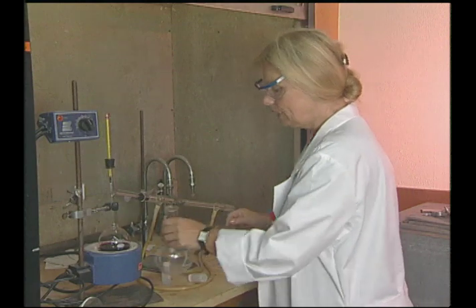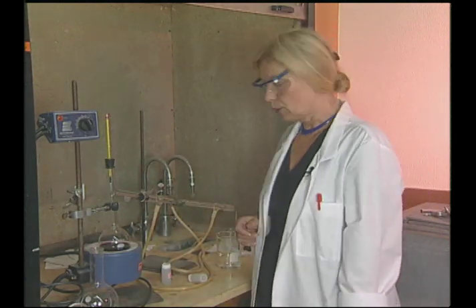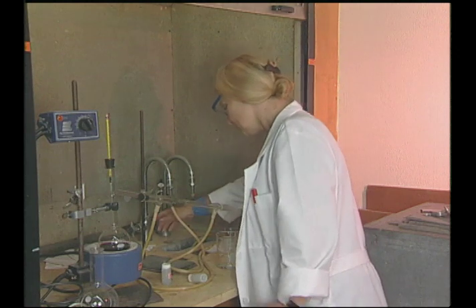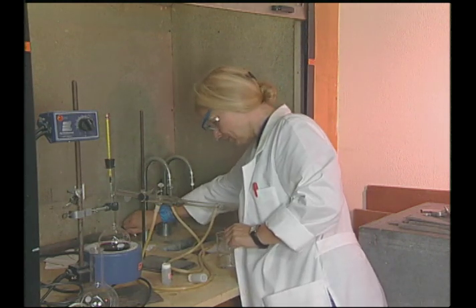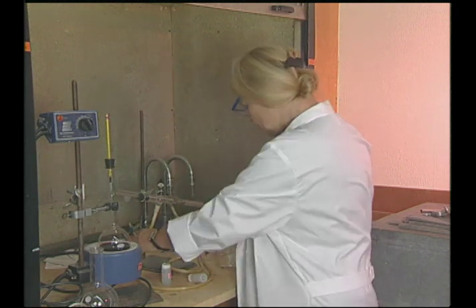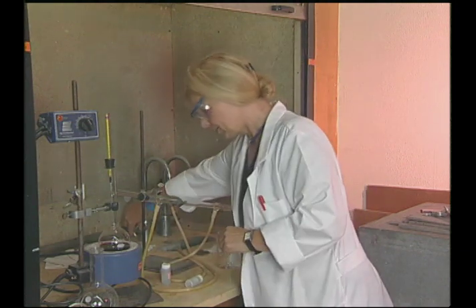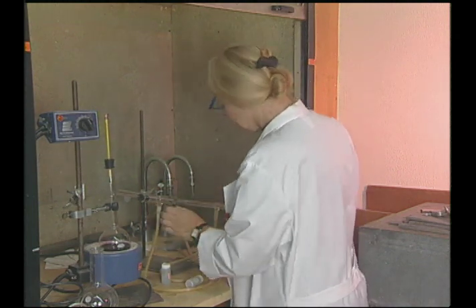And we need to be able to cool the evaporating liquid by condensing it. And we need what we call a cooling mantle. And this is done by water from the faucet. So the water should come in from the bottom, which is done wrong here. So we better turn it around.